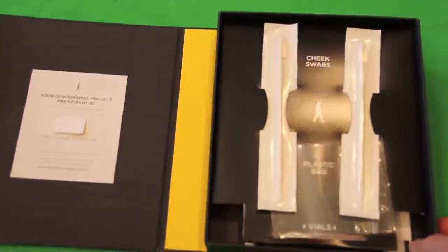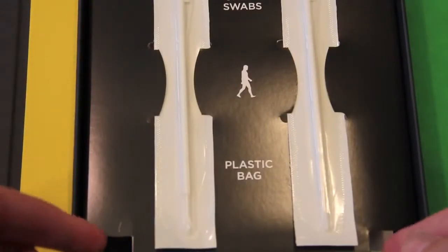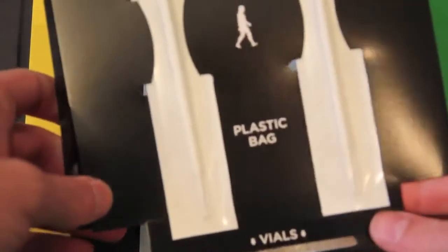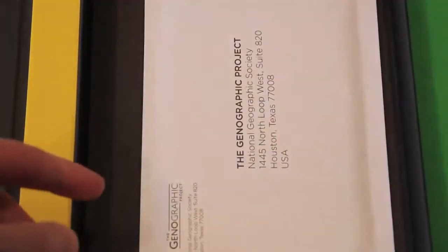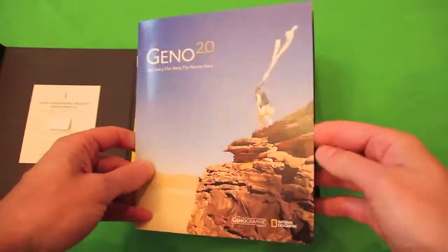And then we have our two cheek swabs. So you have two of them here, applicators and a little cotton swab. Showing it to you a little bit closer up here. You're going to put them in these vials. I think we'll show you that in more detail in just a second. And you're basically going to send this back. So just continuing on with what you have in the kit, one final piece, and that is the envelope to send this back to the Genographic project. So let's look in a little bit more detail here.